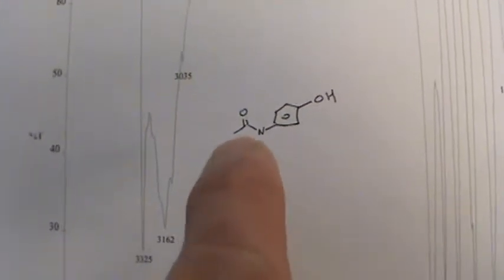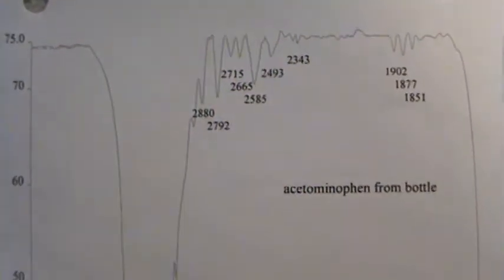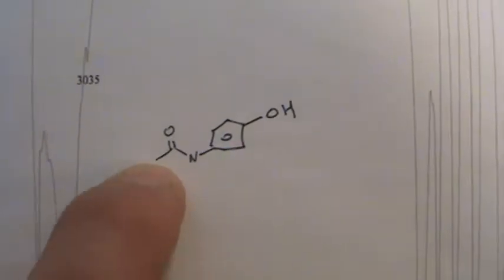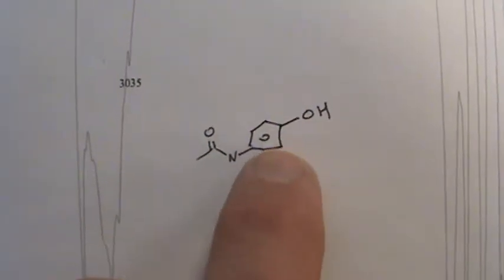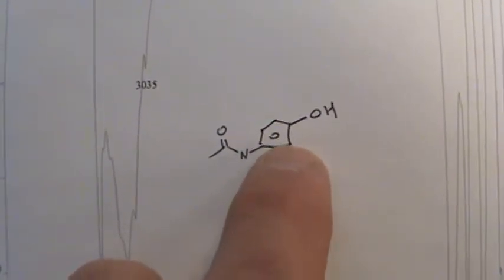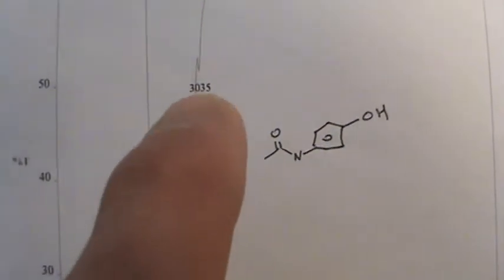We can't make out the CH3 29 something. Look how small that is. So it's not very definitive. We can't label the CH stretches of the alkane type. The aromatic carbons with hydrogen stretching might be buried in here, like 3035 and that.